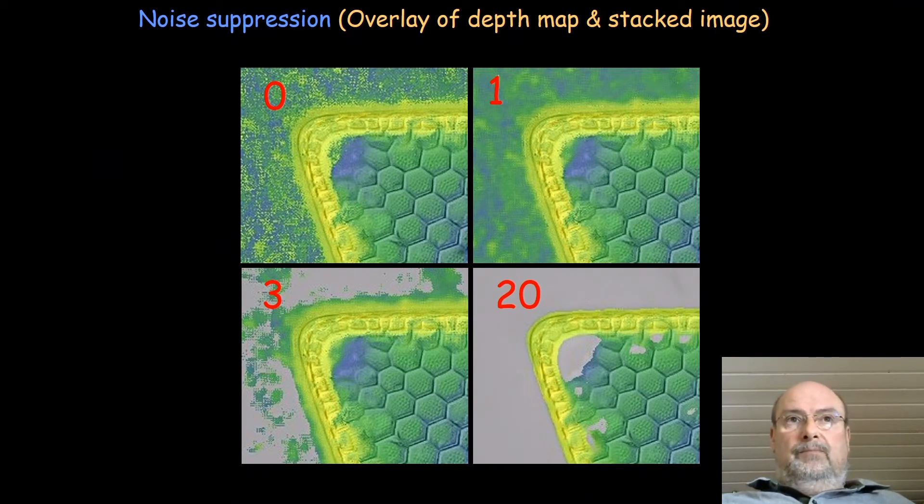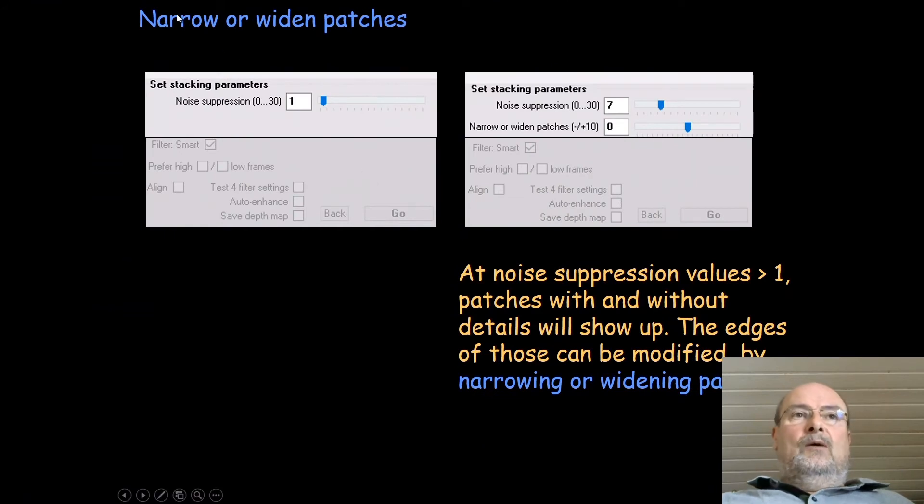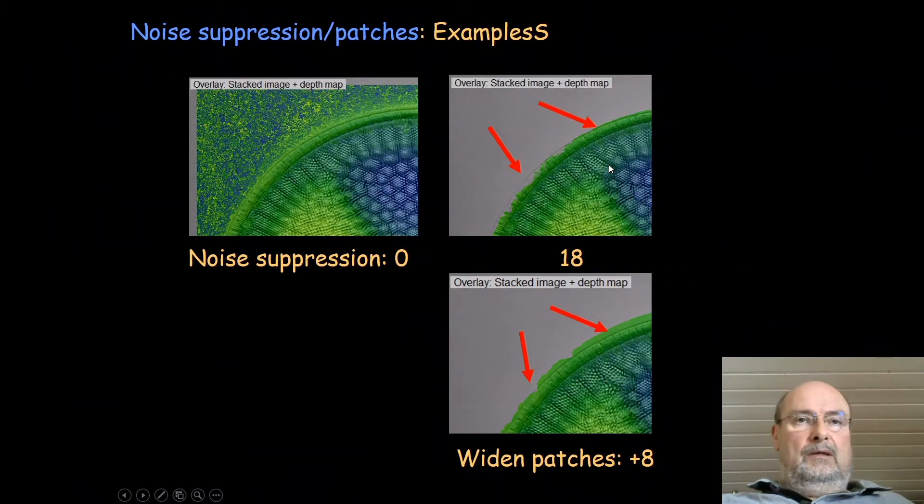When we have values above one, there is a new line that says narrow or widen patches. It can be plus or minus values and these help to modify the edges between structured and non-structured areas. You can make the structures a little bit wider or more narrow.